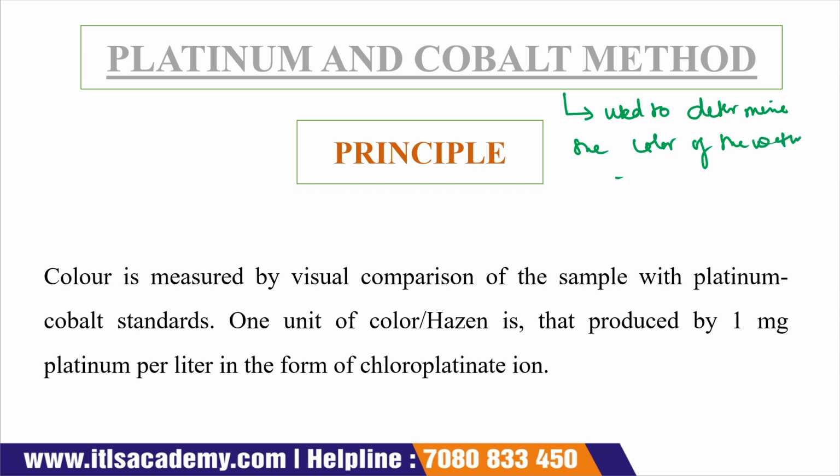So the first method that we are going to use is the platinum and cobalt method.